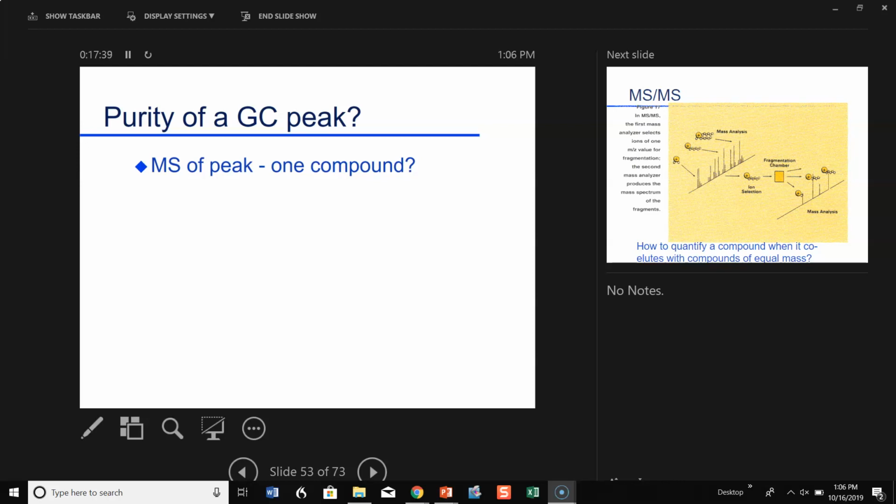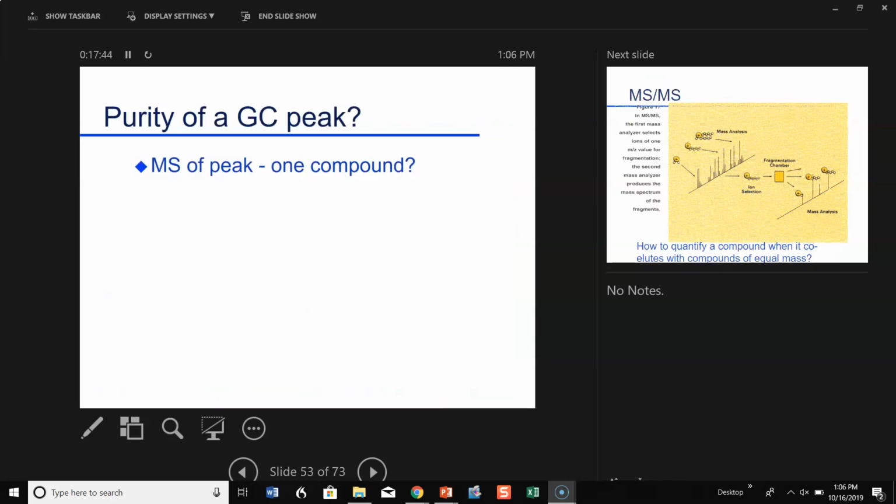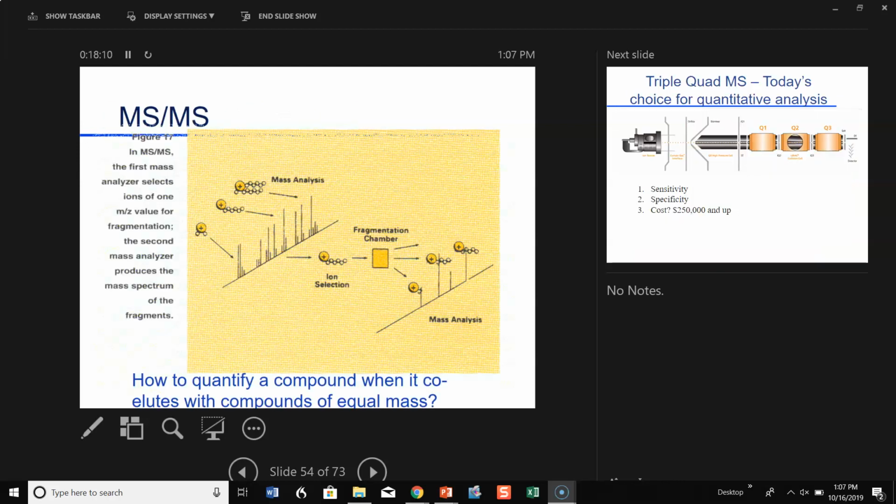Purity of a gas chromatographic peak. That is always the question. Is there something that's simply one compound? Is it, you got a peak? Is it a mixture of 2 compounds, 3 compounds? Who knows? You really don't know. Your machine draws the line, and it doesn't tell you what's in that peak. So, doing mass spectrometry, monitoring, looking for a mixture of compounds, looking: is the compound present that you think is present? That's an exceedingly useful function of mass spectrometry.